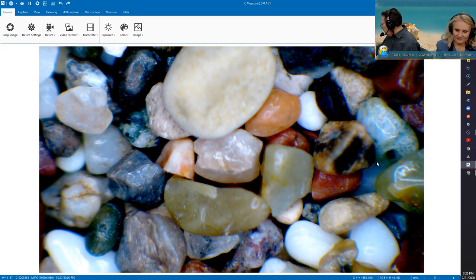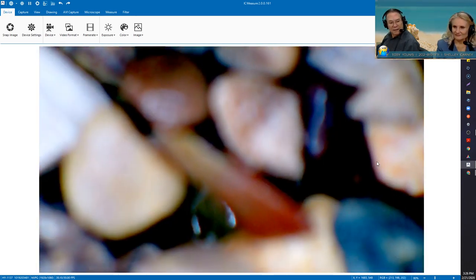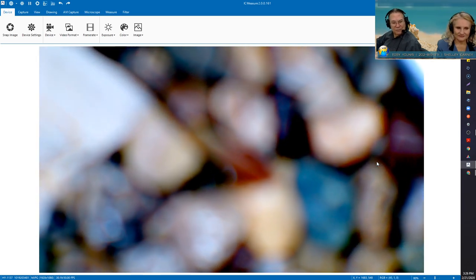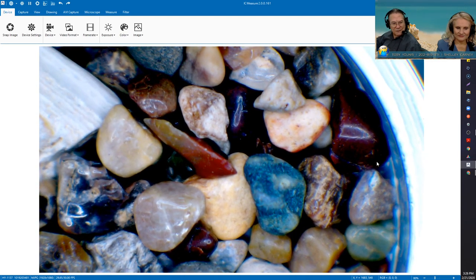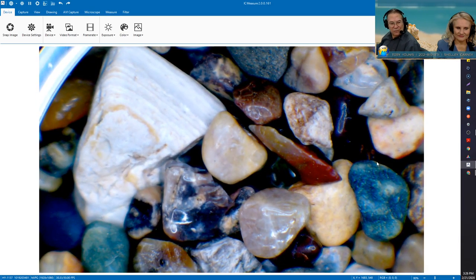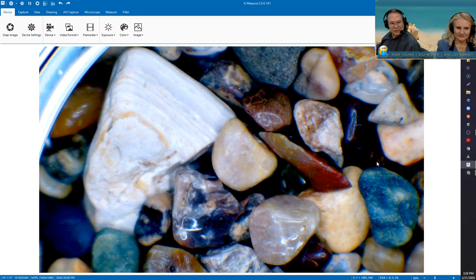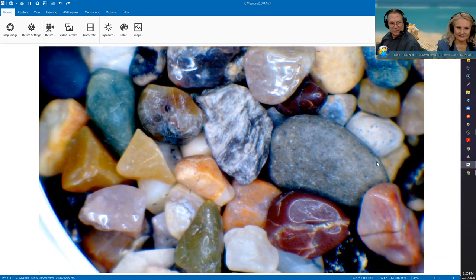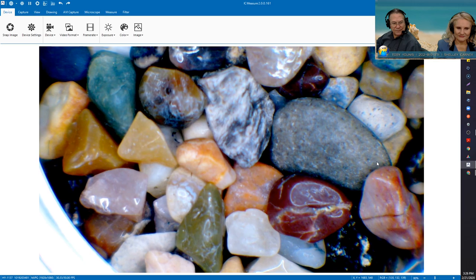So let me go to the bigger of the two samples. This is the one that's classified as granules. I'm going to have to zoom out even further for this, because they're just, it's almost all the way. I'm back to the maximum wide-angle zoom on this. But not much difference, mostly rocks, very little quartz, very few shell fragments. We have that one big piece there that you saw in the photograph earlier. But that's even larger than the 4 millimeter. I kept it just because it didn't make it through 2 millimeter. It probably wouldn't make it through a 4 millimeter sieve either.